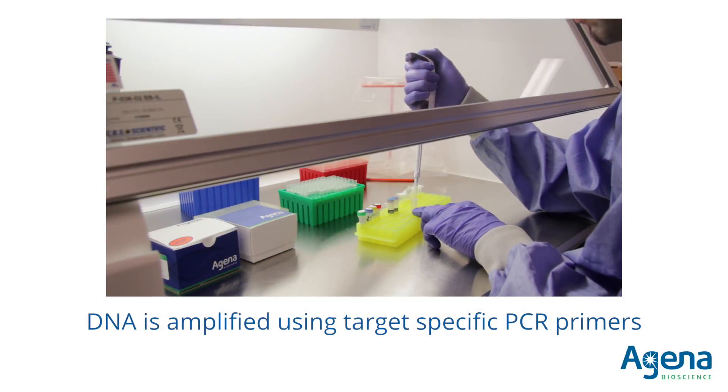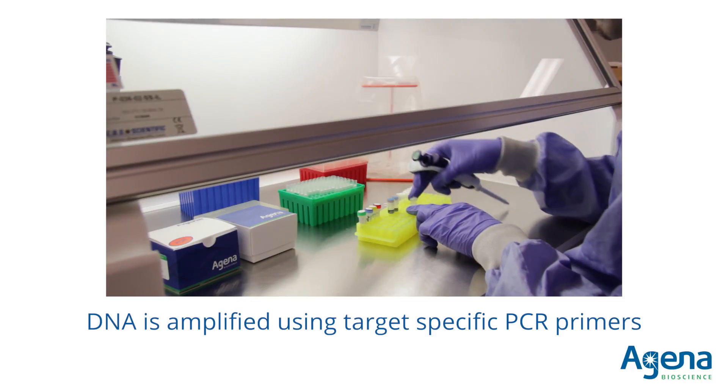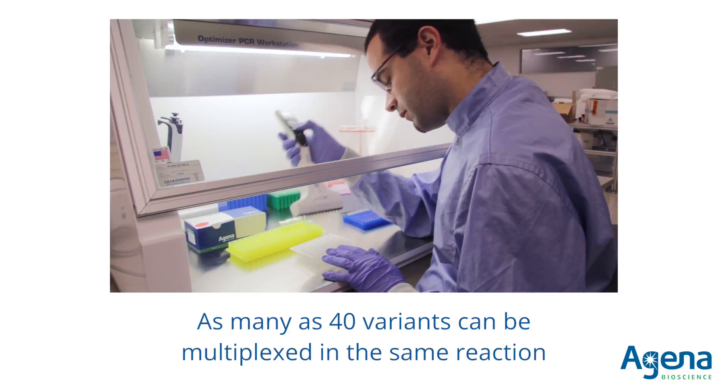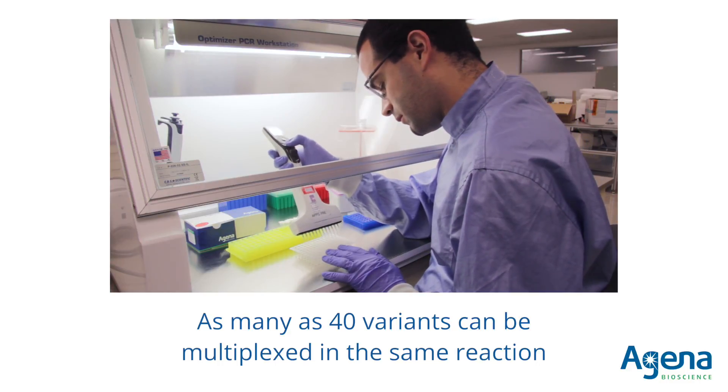Input DNA first is amplified using assay-specific PCR primers. Primers are multiplexed in a single well, allowing as many as 40 targets to be amplified simultaneously.